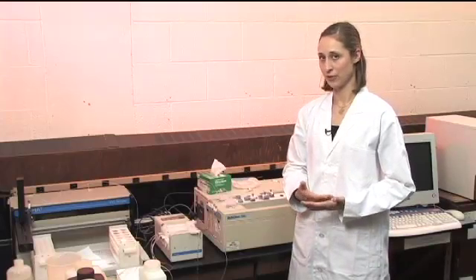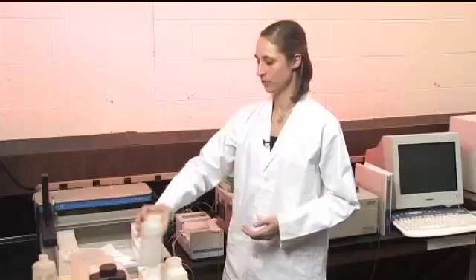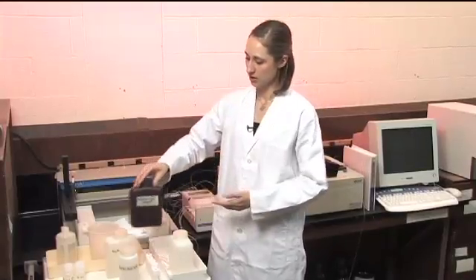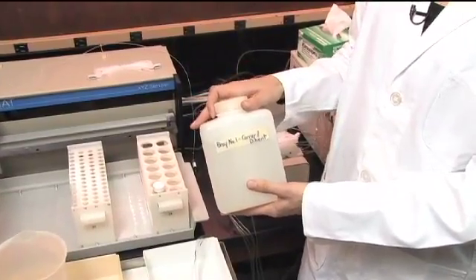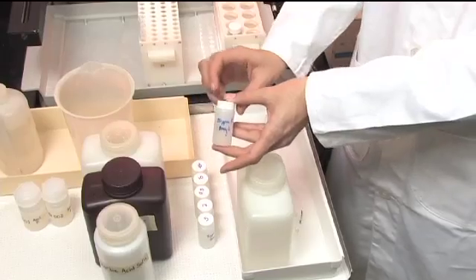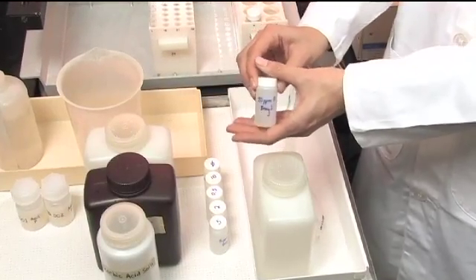Now we need to make sure that we have our standards and our reagents all prepared for the method. For this particular method, I need an ascorbic acid solution for reducing it. There's a molybdate color reagent, and you also have a carrier and a diluent, which are the same thing in this case, and that's our Bray extract that the samples are in.